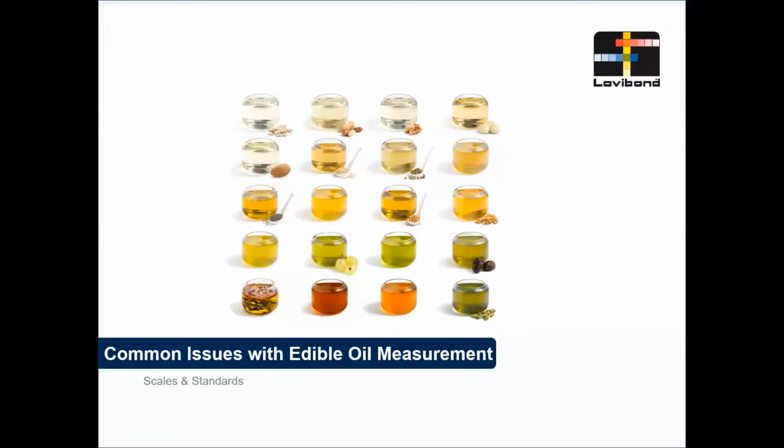Today we will be talking about solutions to common problems in edible oil measurement.